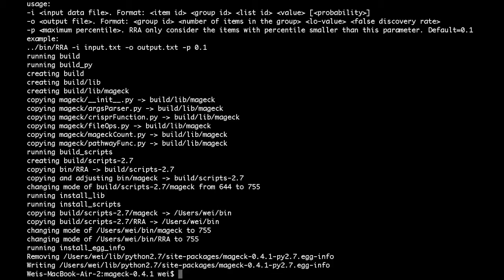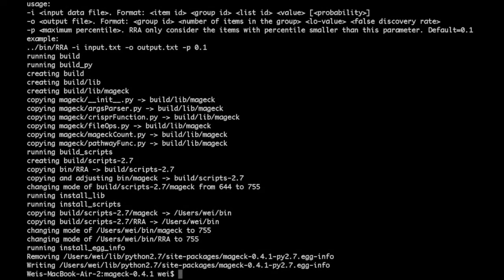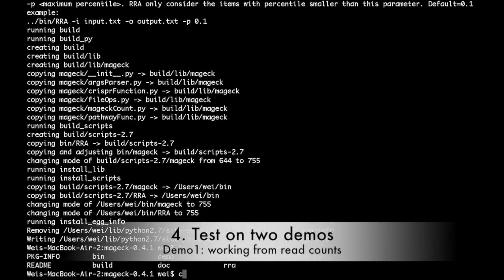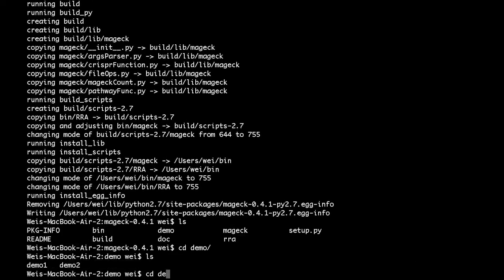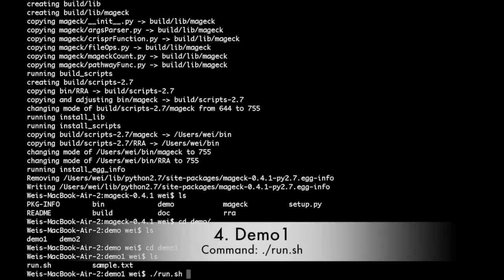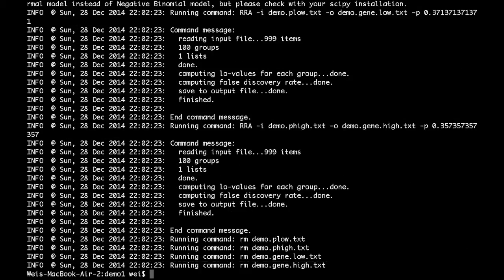If your installation is successful, the output will not contain any error messages and will look like this. Now let's test the software using the two provided demos. Enter the first demo directory and run the script named run.sh. If everything goes well, you will see several additional files created in the directory.